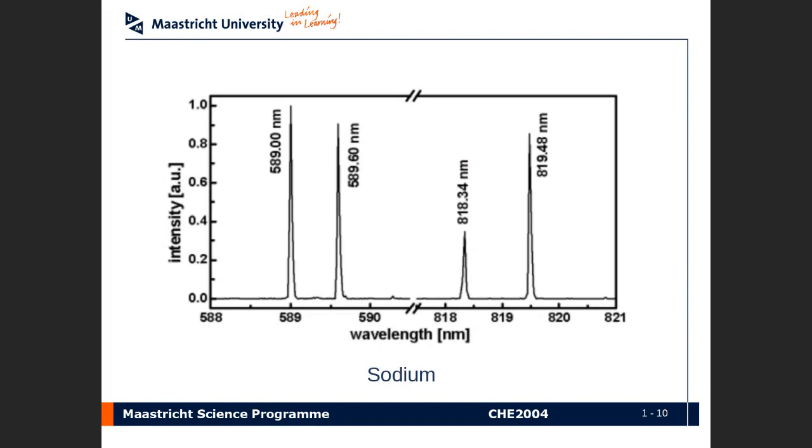This is an example of a spectrum, a sort of a UV-Vis spectrum for sodium. You can see here four lines in the spectrum. This is actually not really UV-Vis, because this is just elemental sodium. But this corresponds to the specific quantized energy levels within sodium. So here, actually, this is very simple. It's even simpler than the slide I showed you before, which is looking at it for a whole molecule.